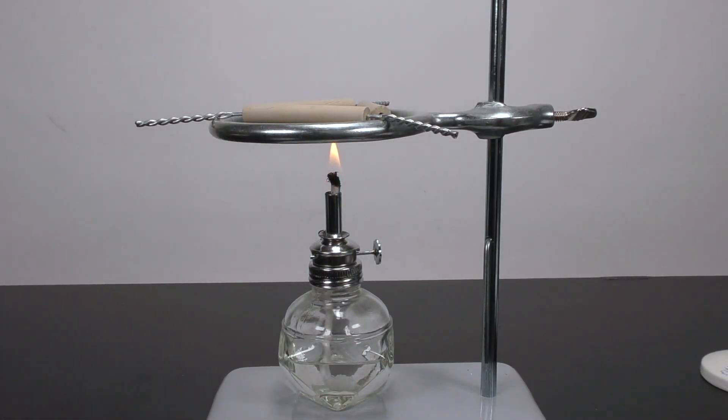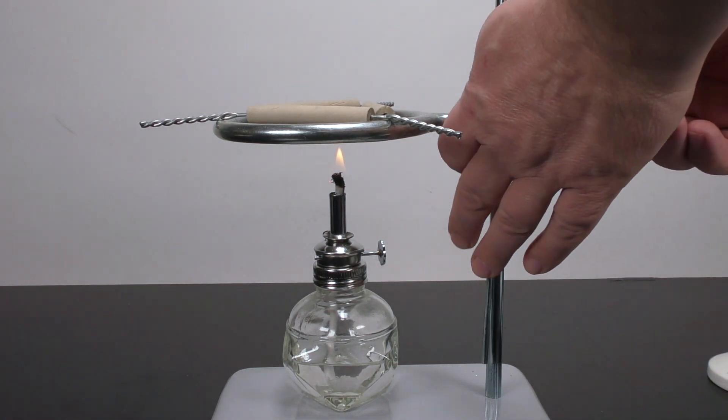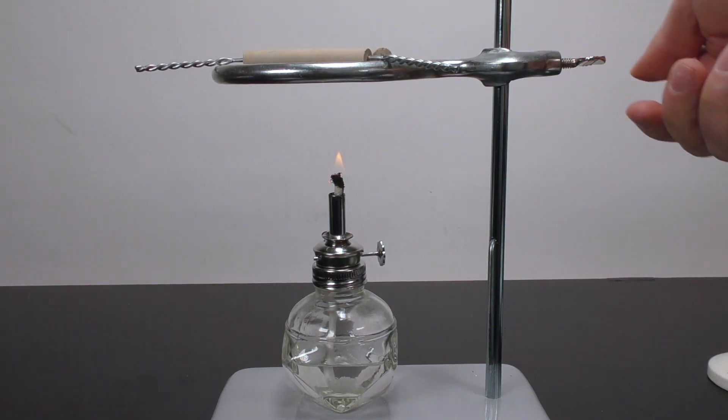Always familiarize yourself with the experiment prior to starting. For example, how high of a flame do you need? Does it need to be very close for direct heat or should you have it far away for indirect heat?